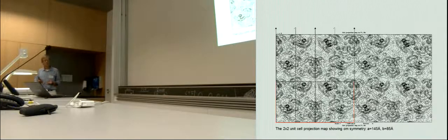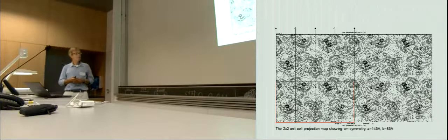And in 2D, one can do it rather easily, but when it comes to 3D and these symmetries, as long as it's not tilted along this axis, the symmetry will gradually disappear, and it will be much more difficult, of course, to index correctly. So, very tedious work to index every image in three alternatives, and then by looking at the merging residuals during the merging process, select the ones that were correct, and thereby gradually building up a 3D structure.